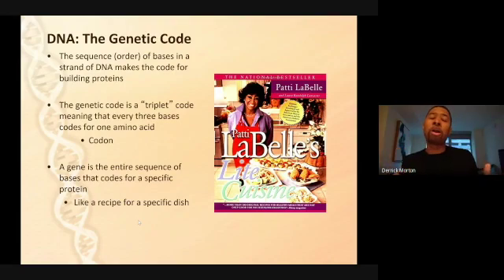And we don't talk about RNA much in this talk because we're extracting DNA from strawberries, but we want to think about each individual recipe in Patti LaBelle's book as the RNA. So the DNA is made, RNA is going to serve as the intermediate that sends the instructions for a protein to be made. And each sheet in Patti LaBelle's cookbook can serve as an instruction for a specific dish, just like our RNA molecules are going to serve as this messenger for making a specific molecule.